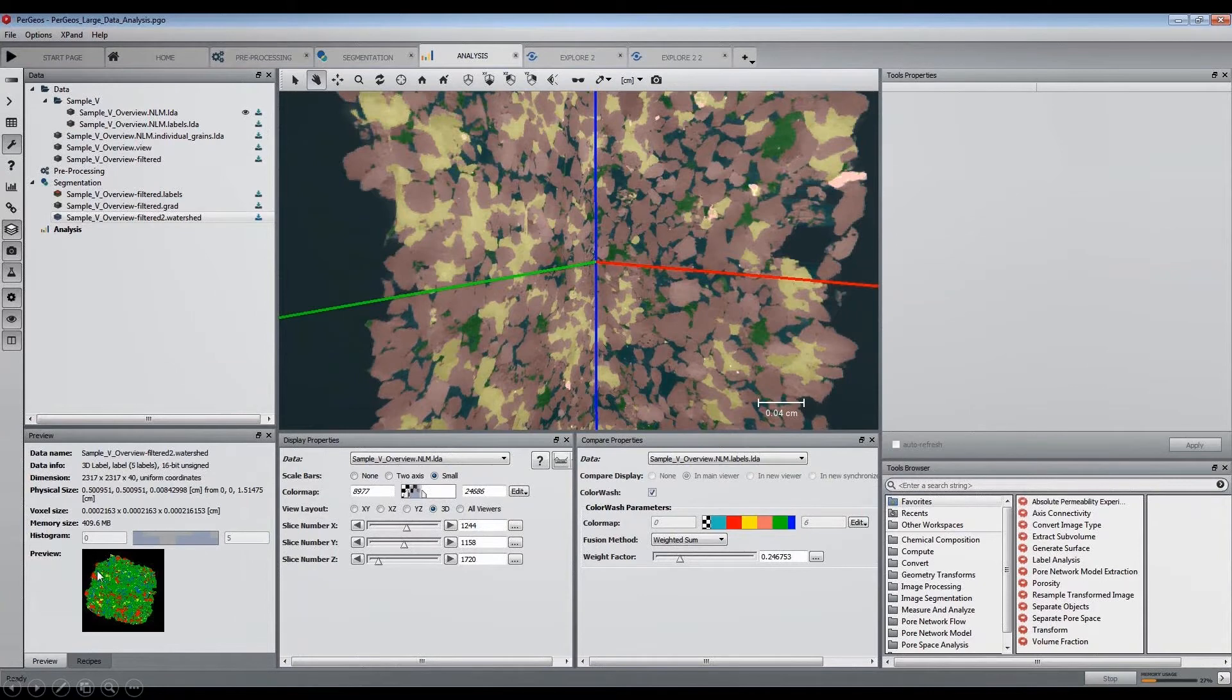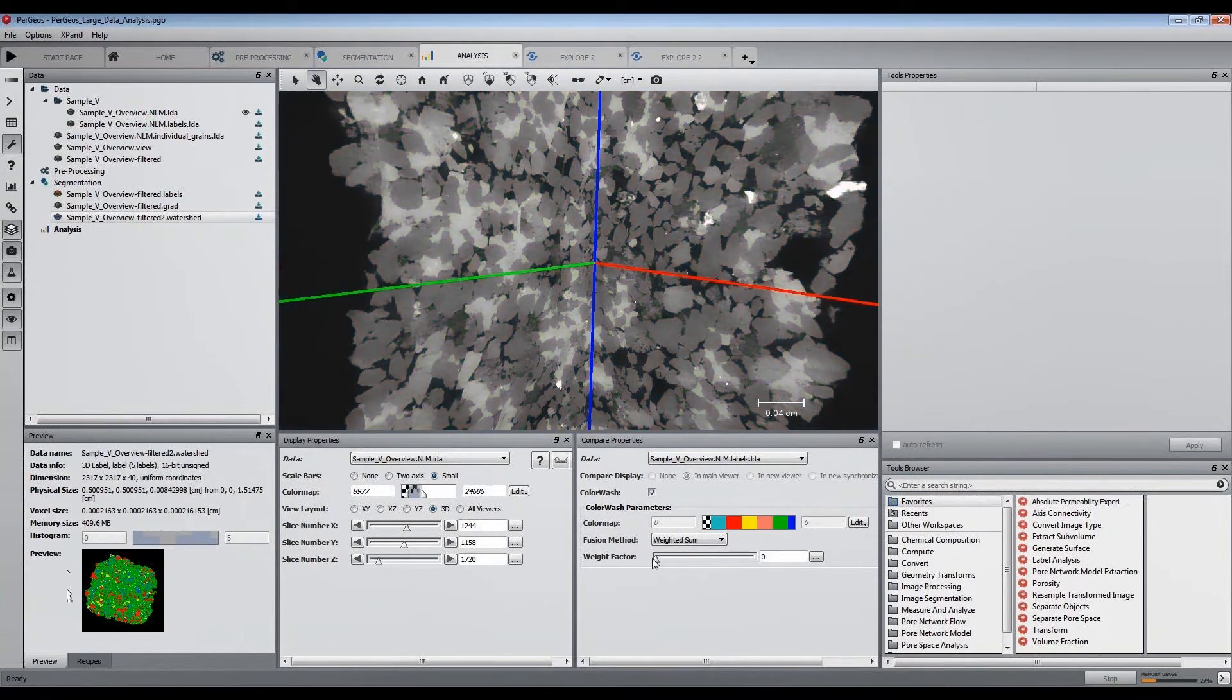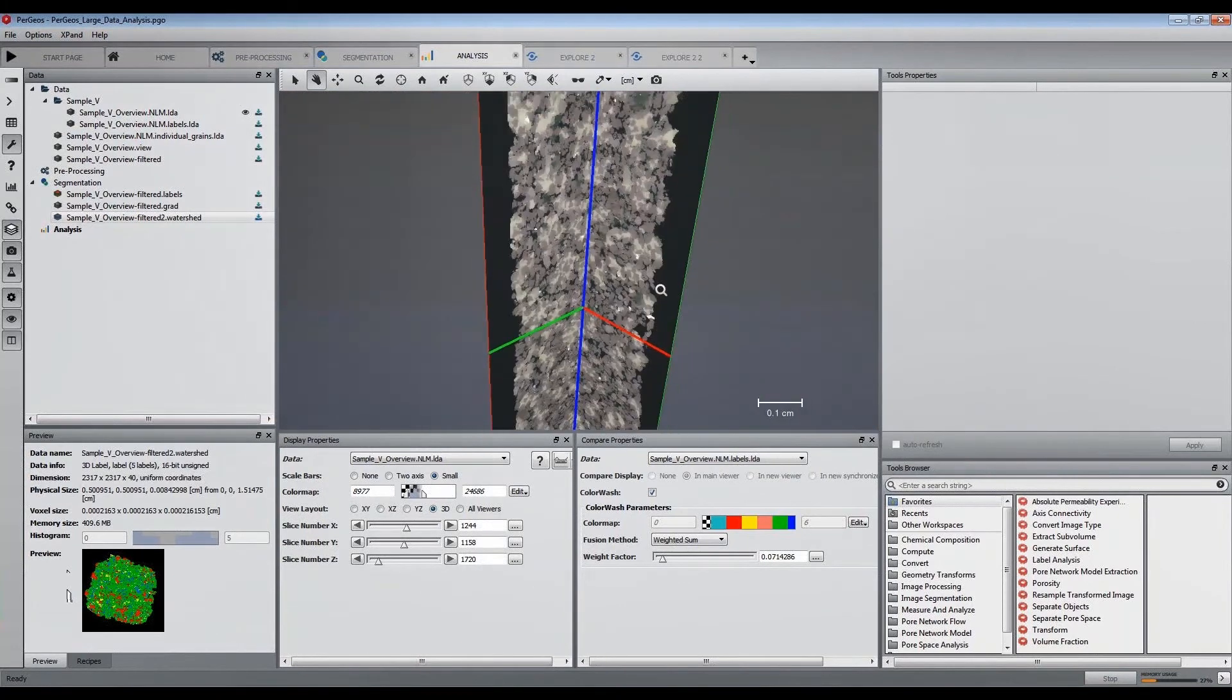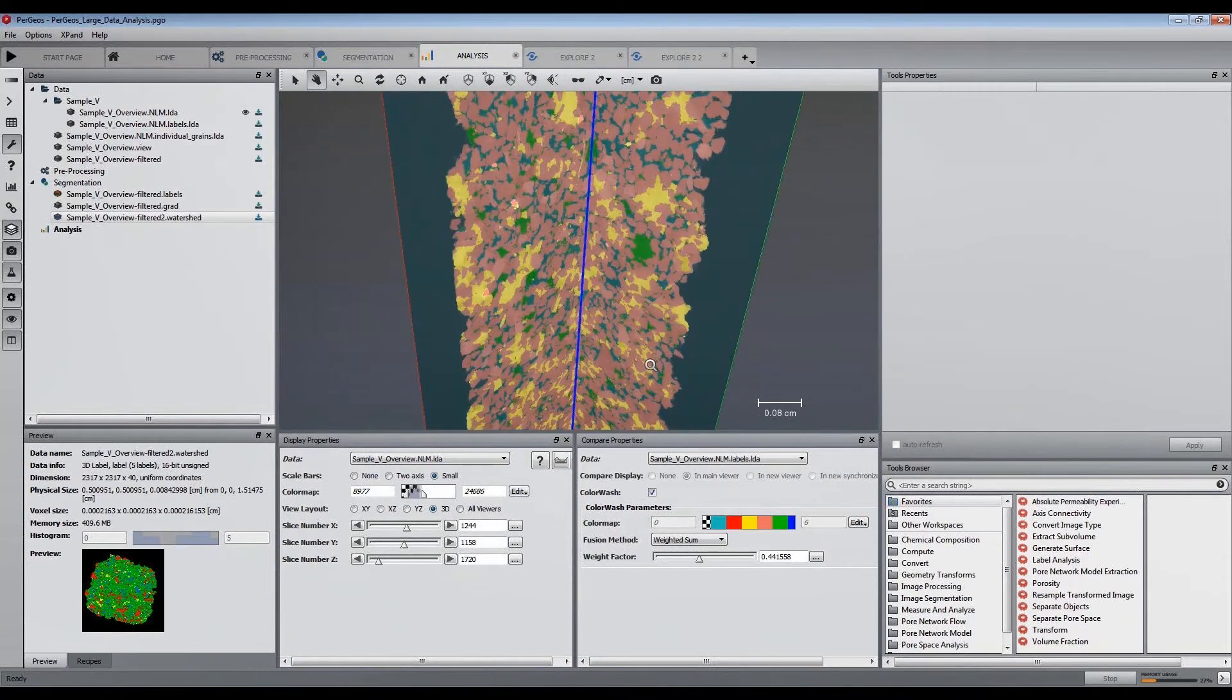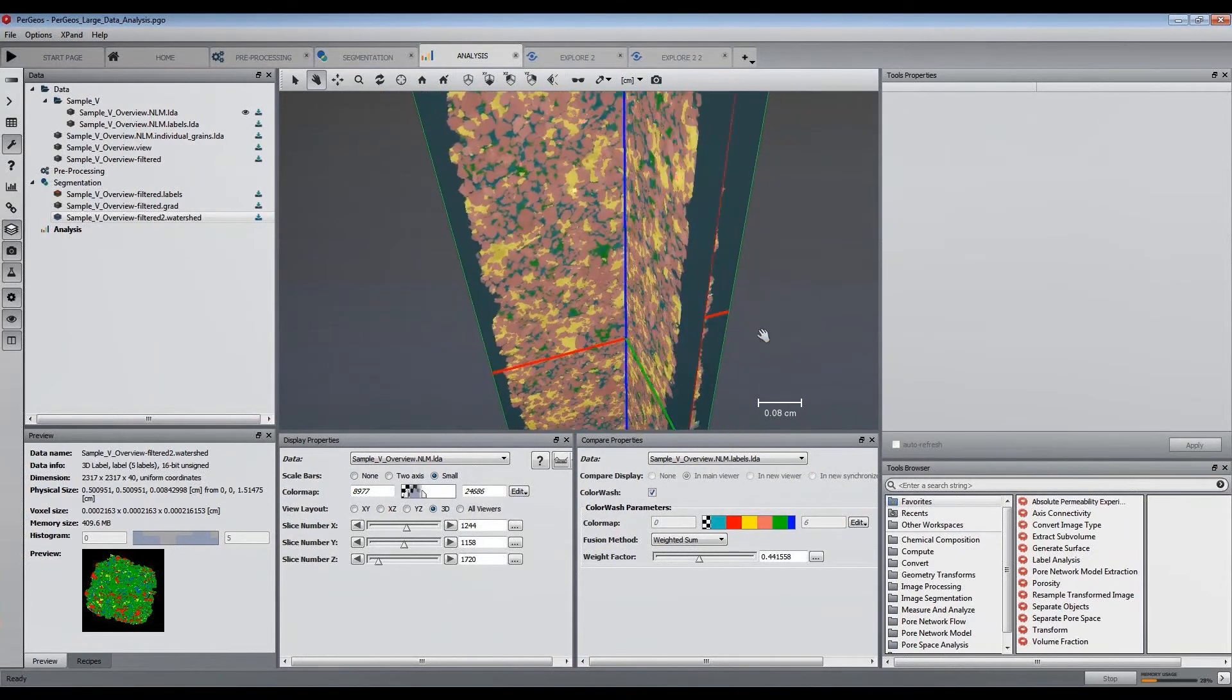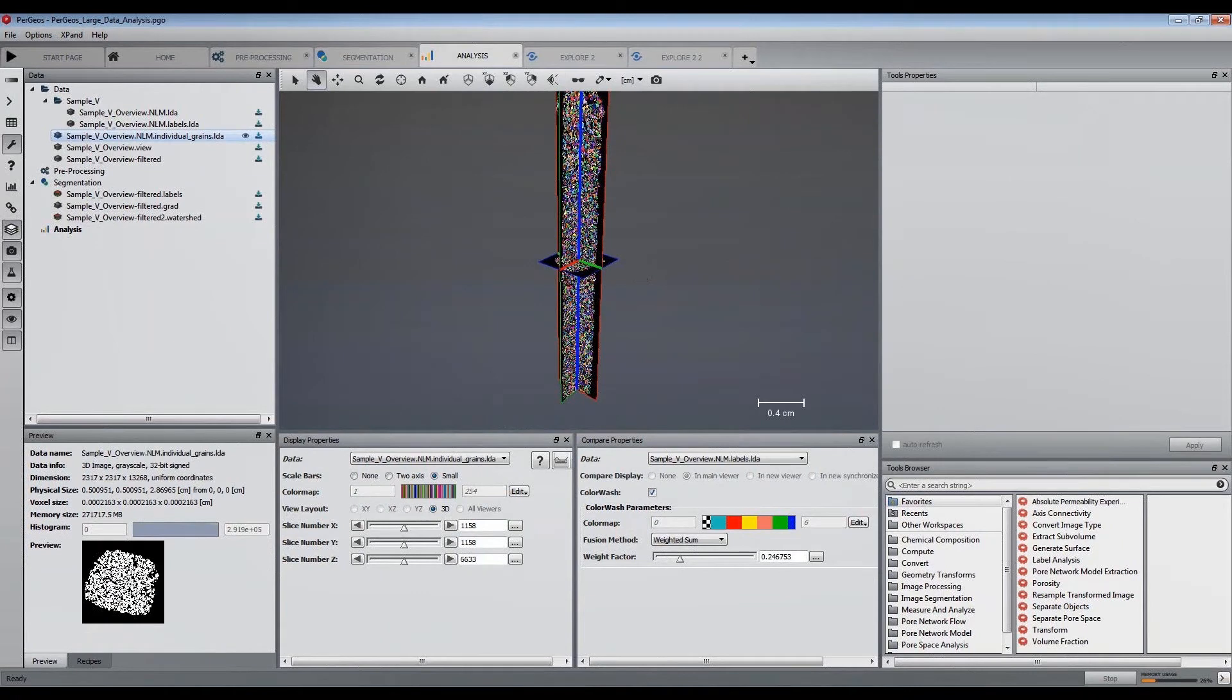Now that the data has been segmented into multiple phases, we would like to separate the quartz grains into individuals for further analysis. Once extracted as a binary volume, the grains have been separated with the Separate Objects module, and a recipe has been created in order to be applied by slabs.